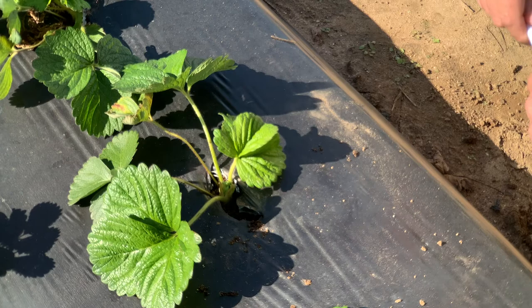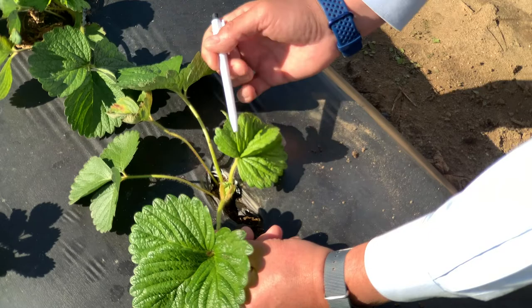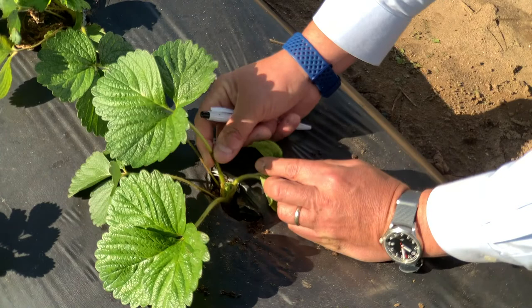On a strawberry plant, sample the most recently matured trifoliate leaf. This is usually the third or fourth leaf from the newest emerging leaf. On this plant, recently transplanted, it is one — here's the emerging tip — one, two, three. This is the leaf that I would take for nutrient analysis.